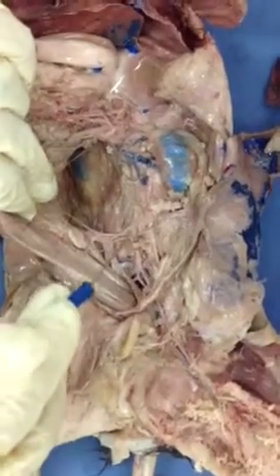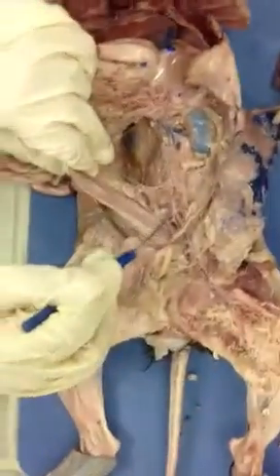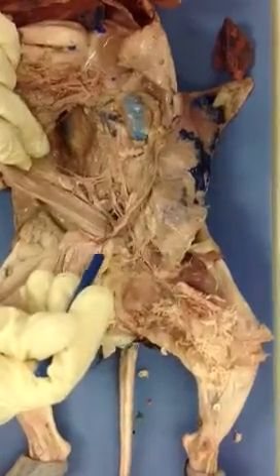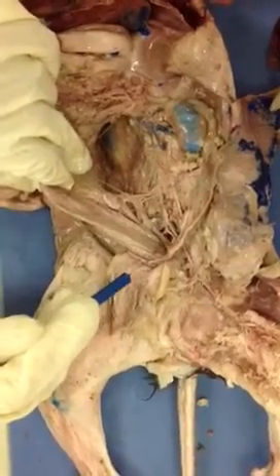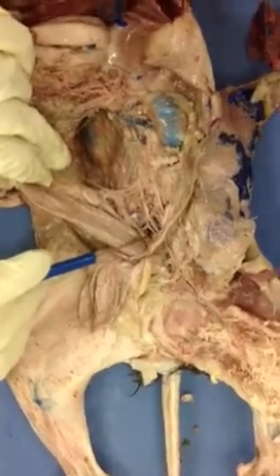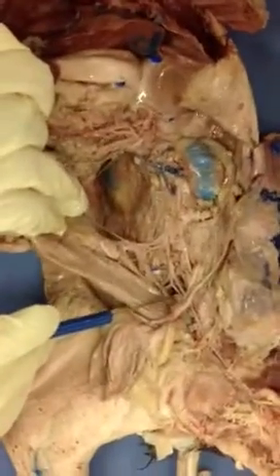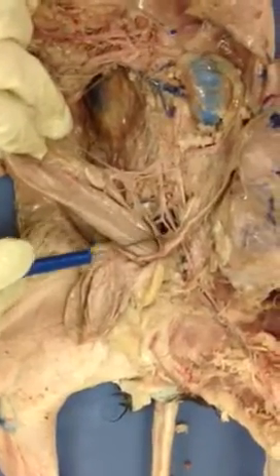Very good. Now, it comes to a point that this aorta gives me two branches, right? So which branch is this there? Left external iliac. Very good. And then this is my right external iliac. Now I notice it also gives me these smaller ones. What are these called? Left internal iliac. Very good. And then towards deep inside there, I see the caudal. You see a very small caliber blood vessel inside the caudal. That one over there. Okay?